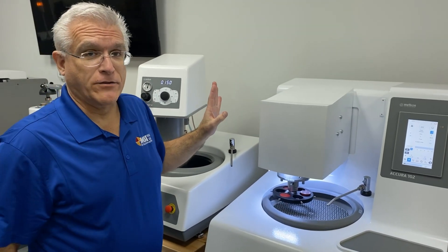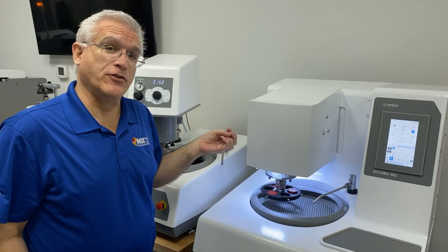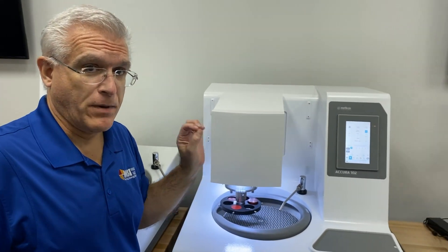It has the ability to automatically dose out your suspensions and polishing solutions, so that allows you to save money and have more precise polishing.